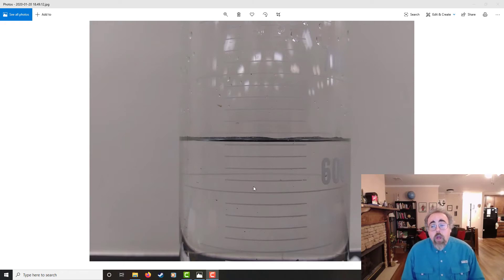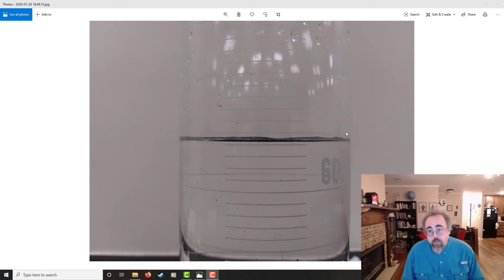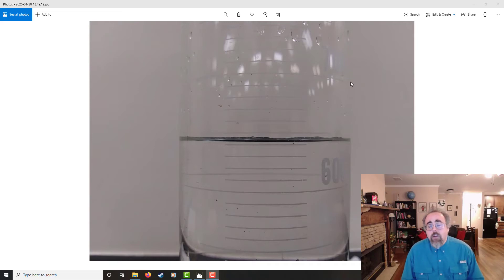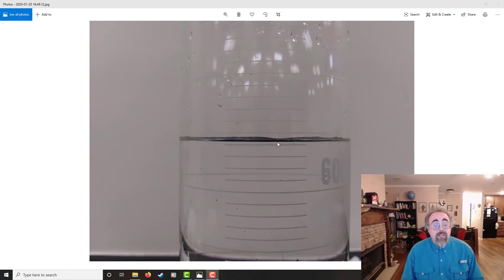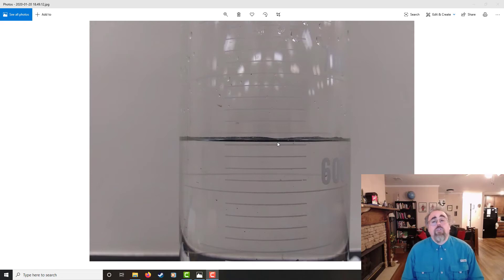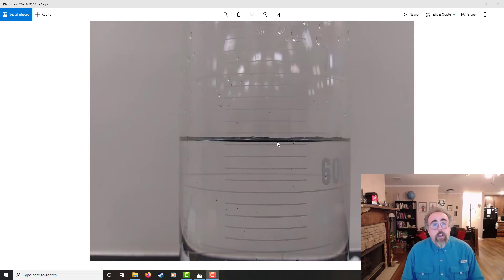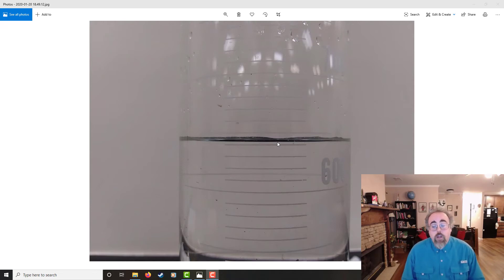It is still glass, though. So as I'm going up, 1, 2, 3, 4, 5. No, so that one's bigger. The photo is not right. 6, 7, 8, 9, 10. Okay, it's a longer one. Okay, so these are going to be by 10. So that's 610, 620, 630, 640. Once again, bottom of the meniscus, that's 650. But I'd say like 642, 643 for this one. So get a nice three sig figs.